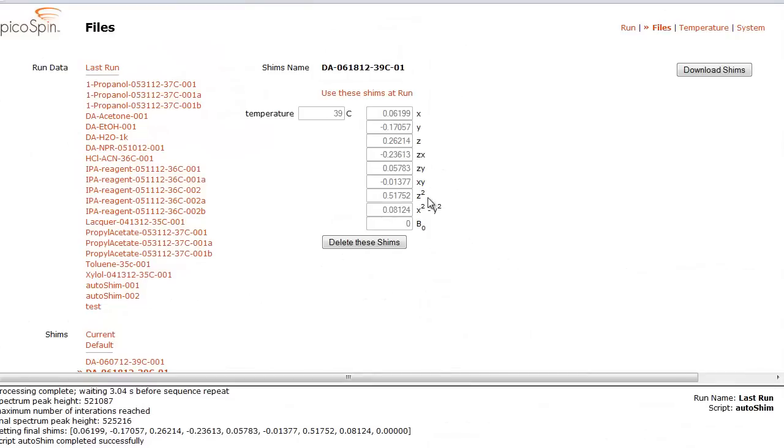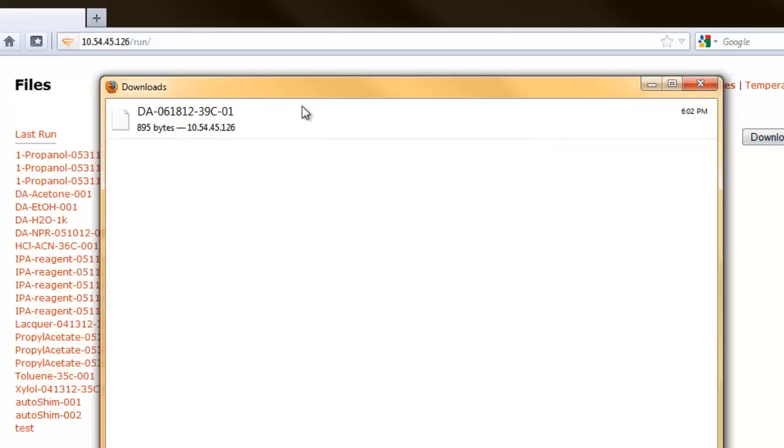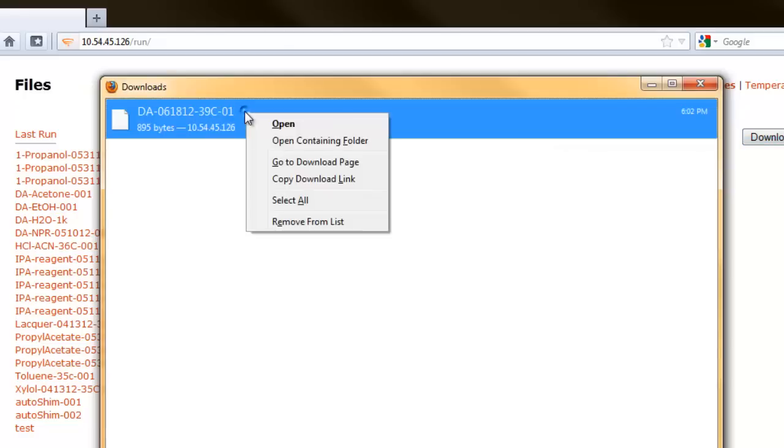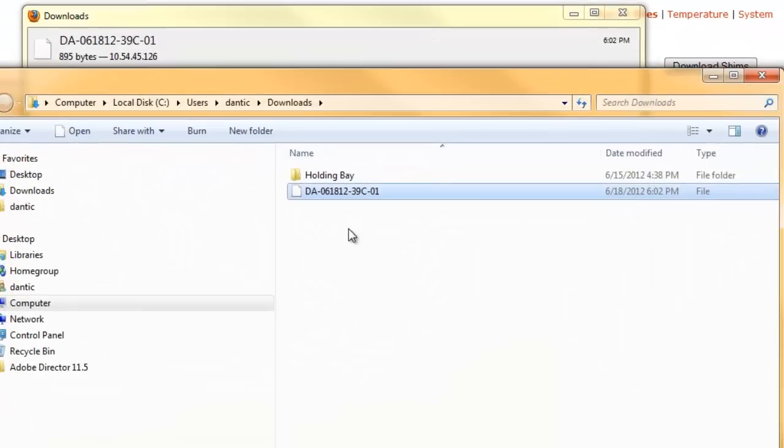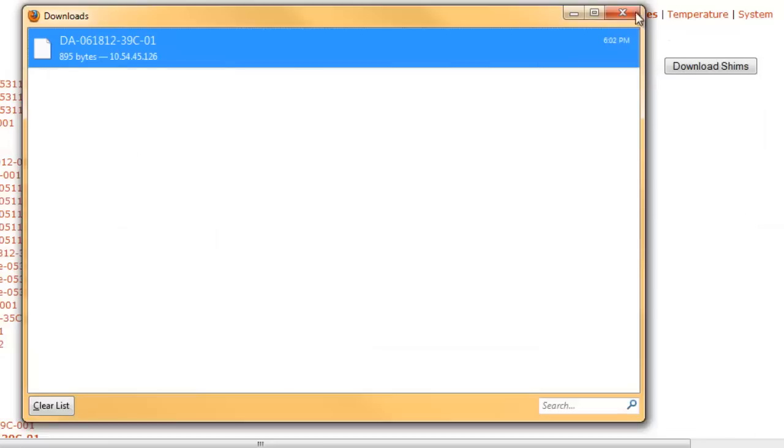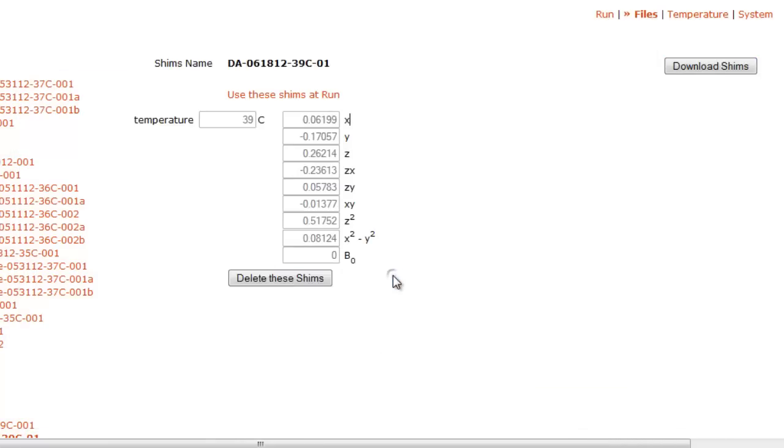We now have the option to download the file for storage on our computer by clicking the download shims button. The file is now in the download directory on my computer and we can open it like any other text file. We can also choose to delete the shim file by clicking the delete these shims button. I'm going to select no in this case.